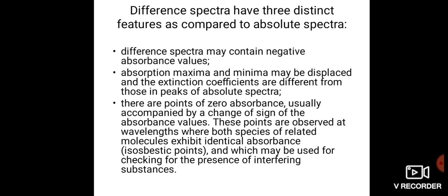There are also points where both kinds of species or molecules exhibit identical absorptions. We call these isosbestic points. These isosbestic points are very useful in understanding the molecules. So this is all about UV-visible spectrophotometry.